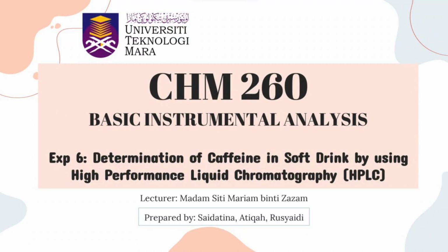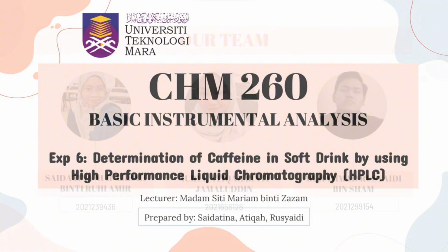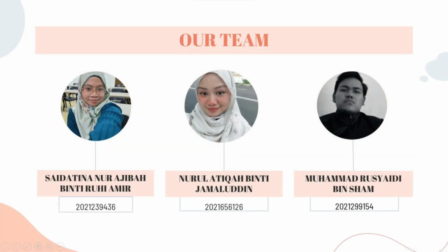Assalamualaikum and hi. Today our group will present about determination of caffeine in soft drink by using high performance liquid chromatography (HPLC). But before we start, we are going to introduce ourselves.